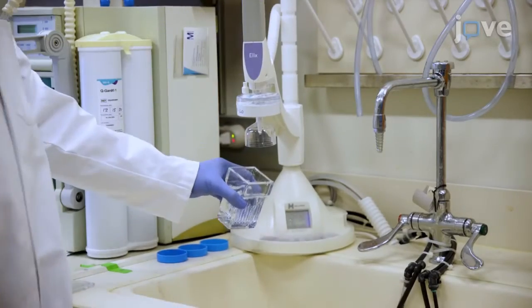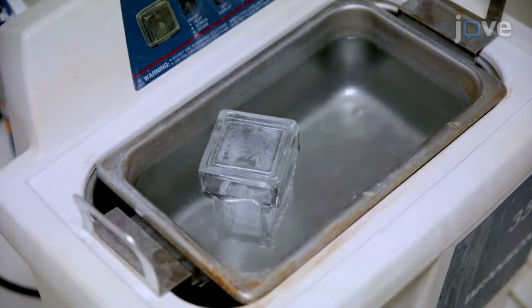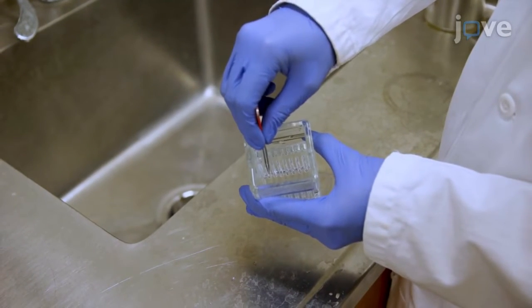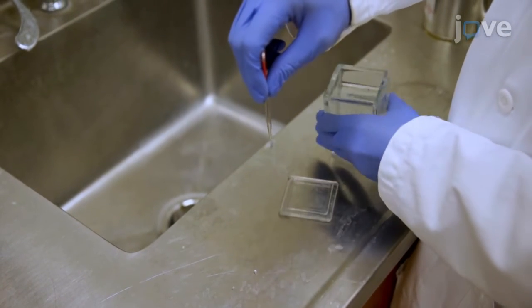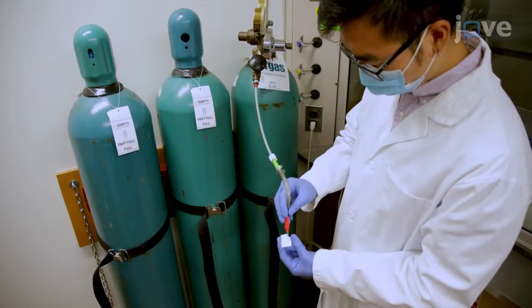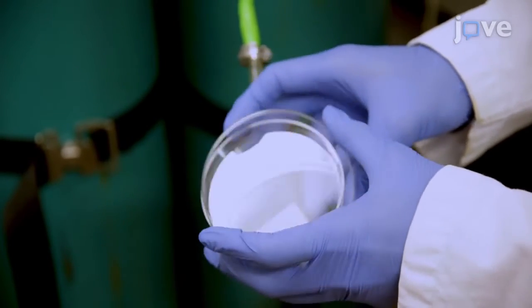Rinse the coverslips with distilled water six times, then sonicate them in ethanol for 10 minutes at 40 degrees Celsius. After washing the coverslips three times with distilled water, gently pick up each coverslip at the edge using forceps. Dry each coverslip with nitrogen gas and place each clean dry coverslip in its own petri dish.